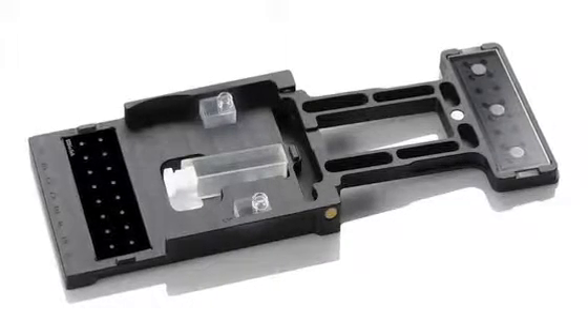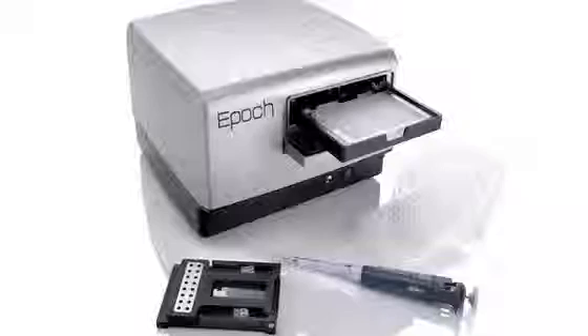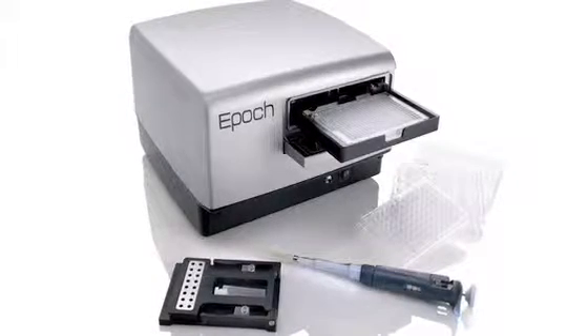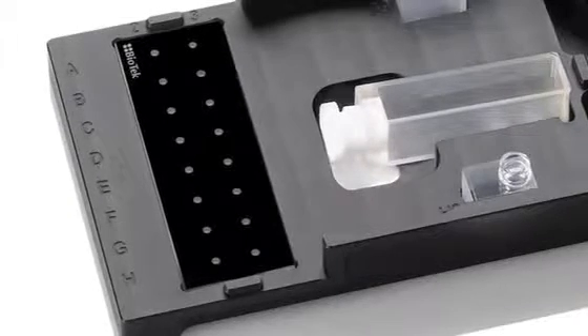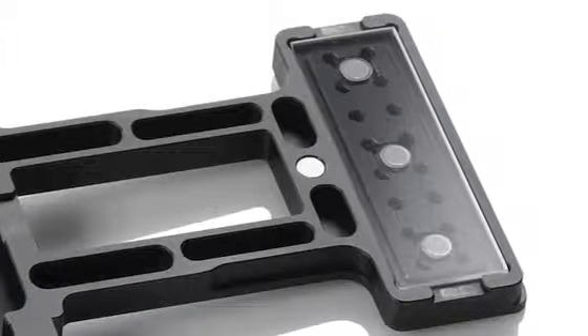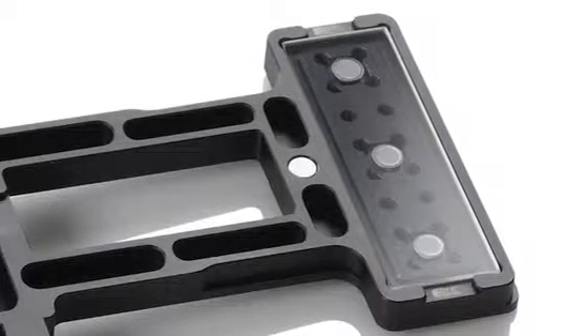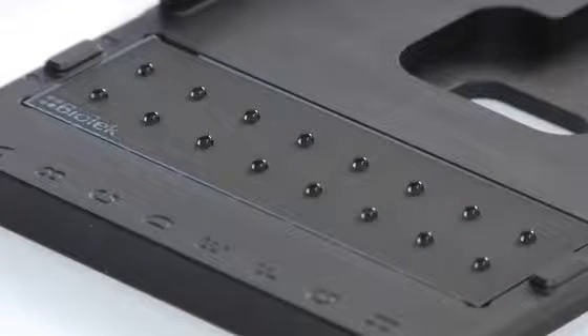Biotech's Take-3 plate has a simple but innovative design for measuring multiple low-volume samples, which is particularly useful for direct nucleic acid and protein quantification. The Take-3 plate has two uniquely designed fused silica slides mounted by magnets to the housing. The base slide is printed with Teflon to form 16 two-millimeter diameter microspots.